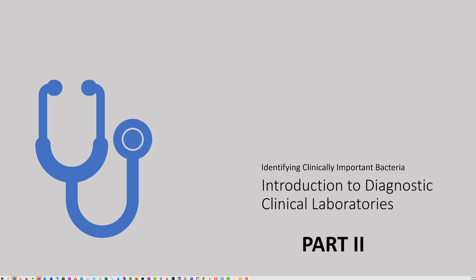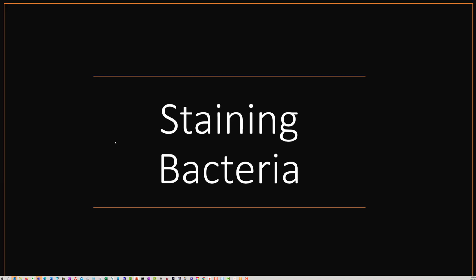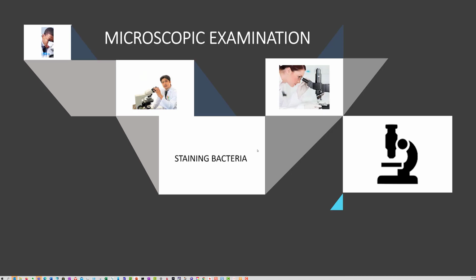All right, let's continue with part two in our quest to understand more about diagnostic clinical laboratories. What we're going to look at for now is just reviewing staining bacteria. I've already covered this, but this is more in a practical sense of staining bacteria so we can see them for microscopic examination.